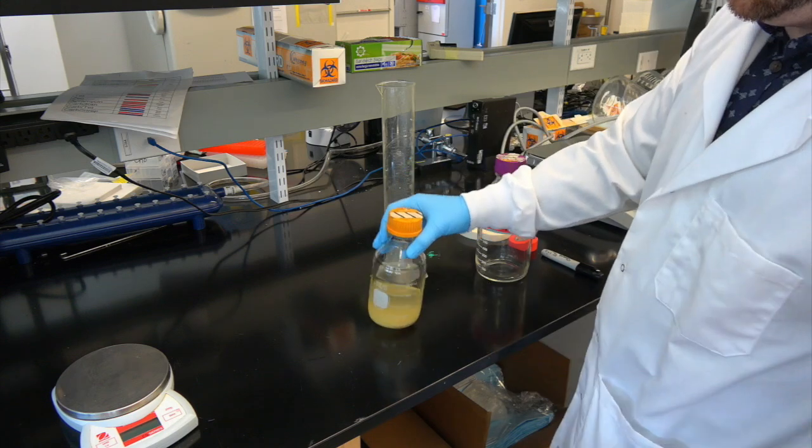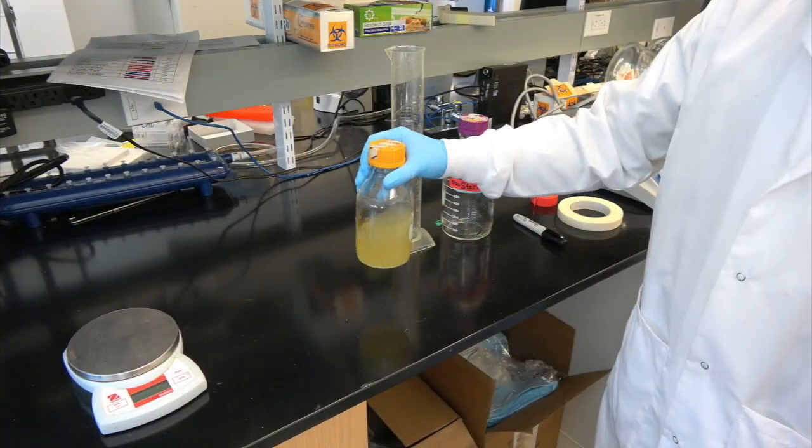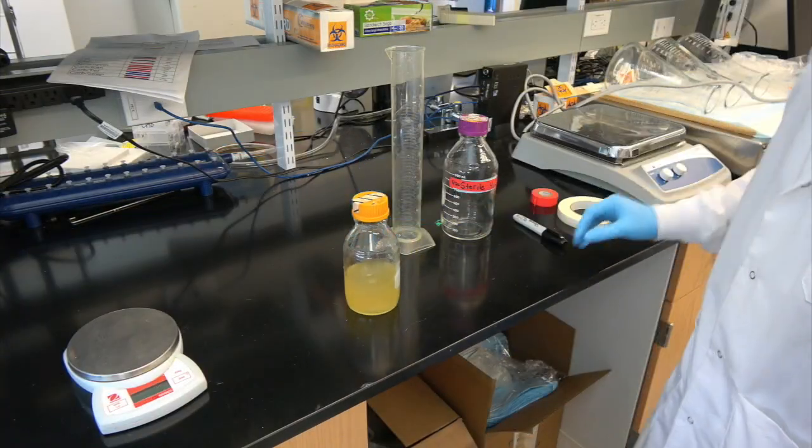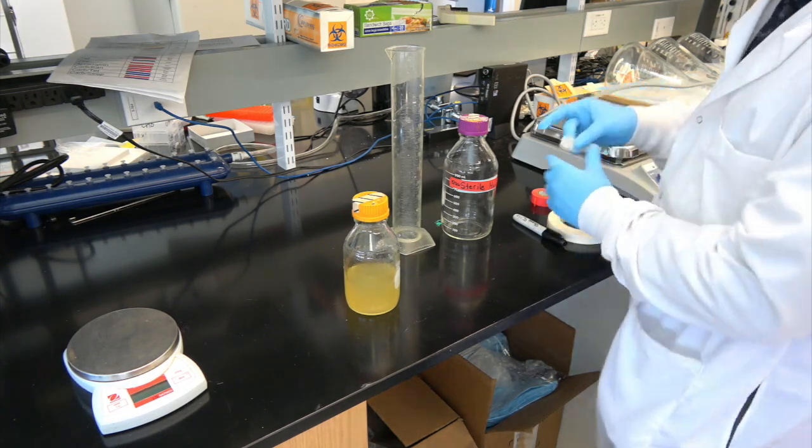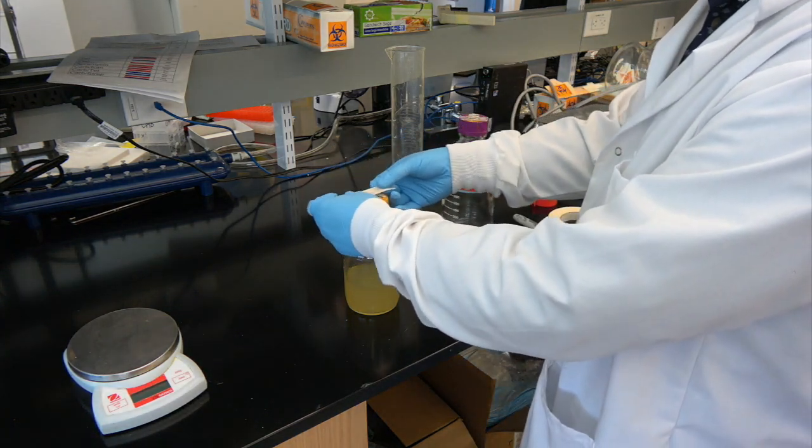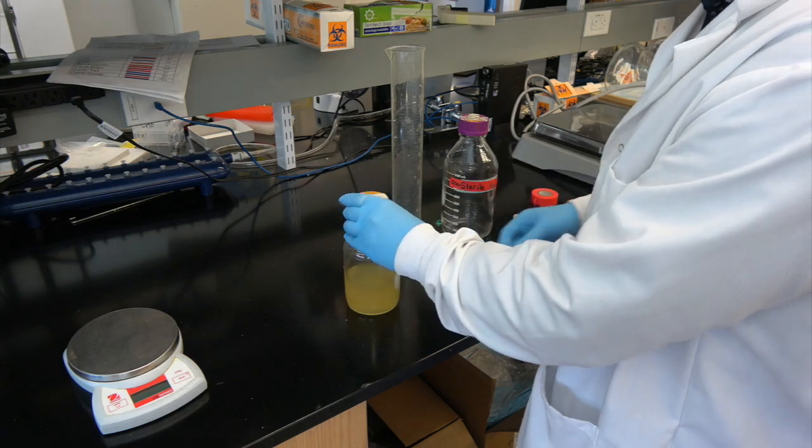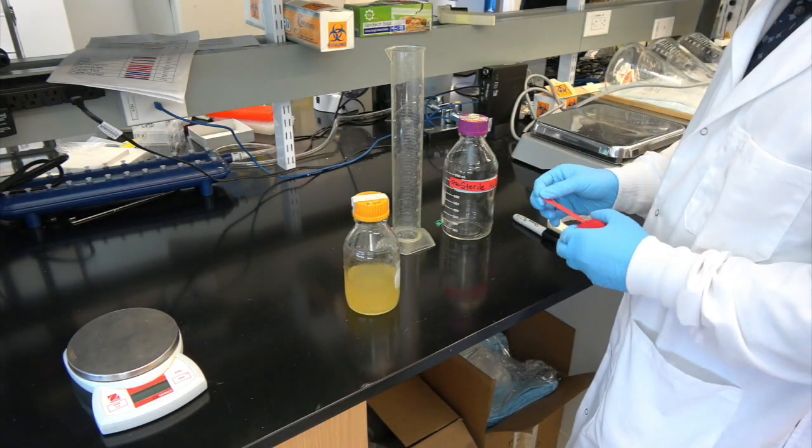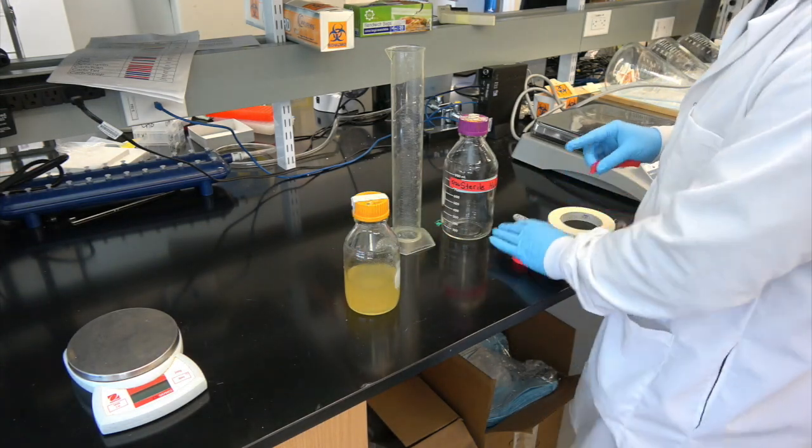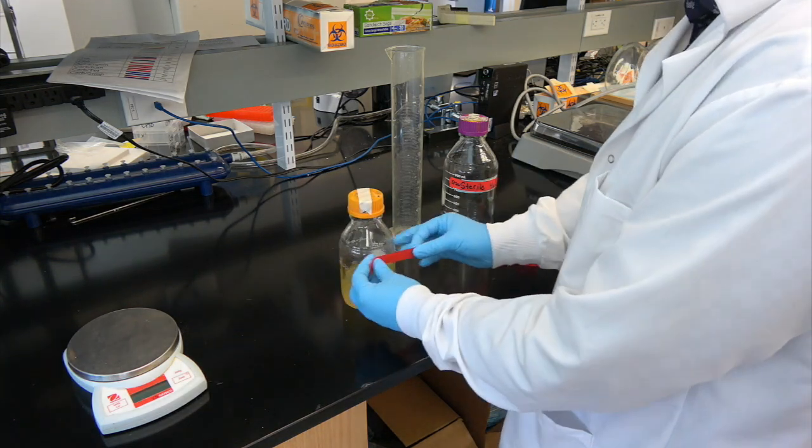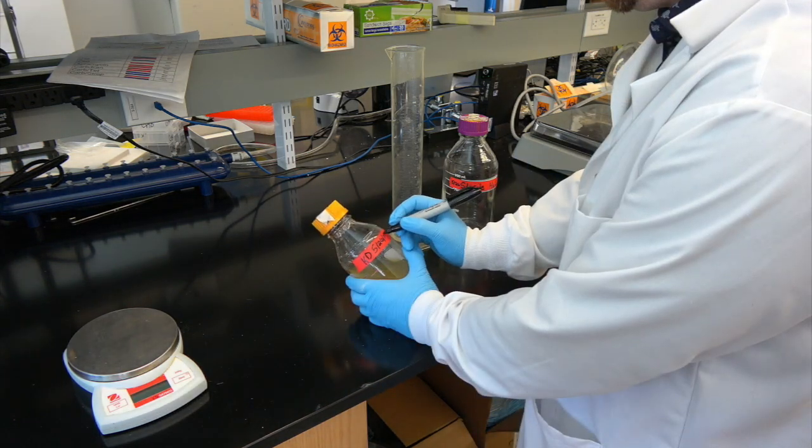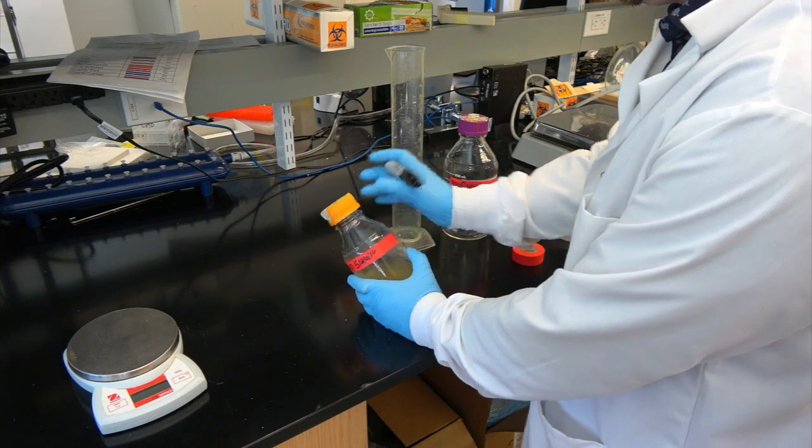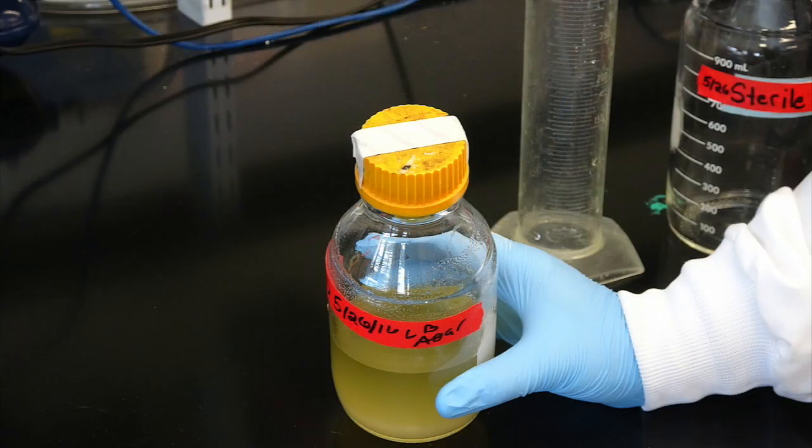Do not make the seal airtight. An airtight seal can lead to cracking during the sterilization process. Next, we add a piece of autoclave tape to the bottle. Autoclave tape darkens when it has been at least 10 minutes at 121 degrees Celsius in the autoclave and lets us know our LB agar has reached the appropriate sterilization temperature. We also add a piece of lab tape to the bottle with our initials, the date, and the bottle contents. This will clear up any confusion should we accidentally leave our bottle in the autoclave, or if somebody opens the autoclave before we do.